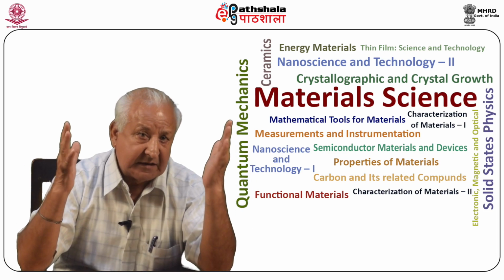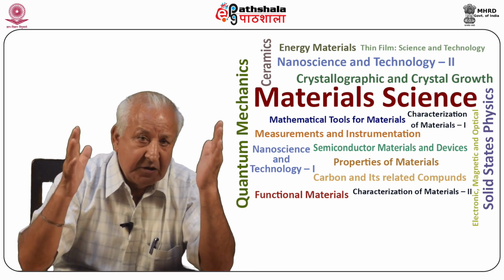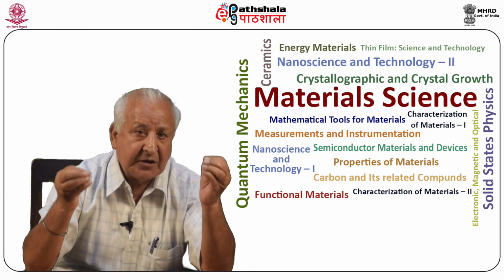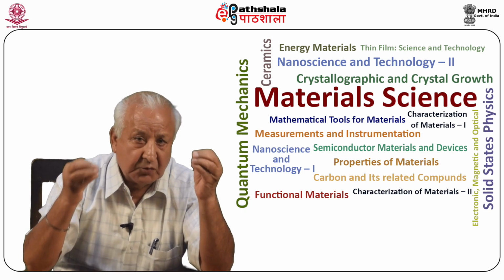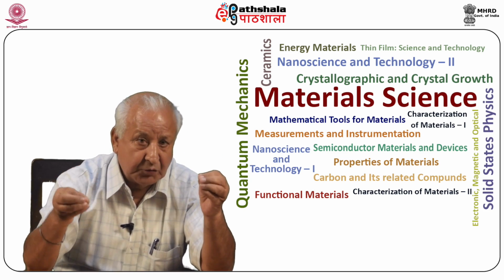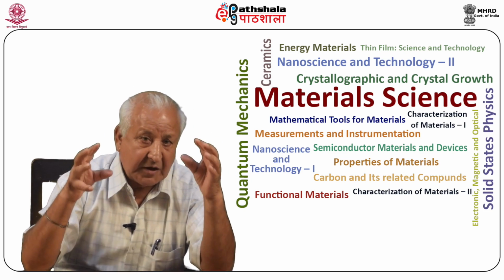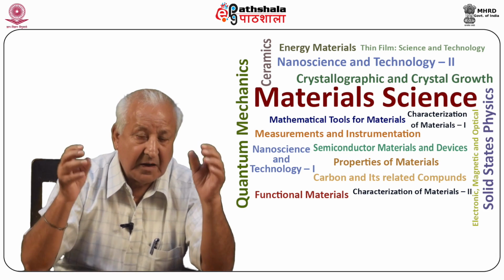U-tube technique. The U-tube technique is a slight modification of the single gel method. In this method, neutral gel is allowed to be formed in the U-tube as shown in figure 27.4c. The solutions of the two salts needed for reaction are poured in the two limbs of the U-tube. These solutions diffuse slowly into the gel medium to produce the required crystals at the bottom base of the U-tube.